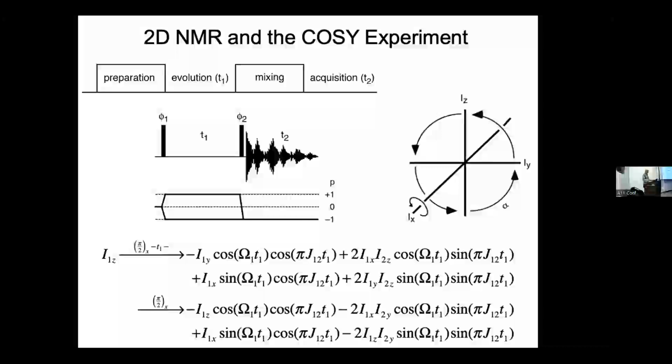That's the same on the computer as swapping real and imaginary parts of the numbers and negating one of them. So actually on a modern spectrometer, when you apply a 90-degree phase shift, no phase is calculated. The spectrometer just swaps real and imaginary parts and negates one of them. It's a lot faster than actually calculating a complex exponential.